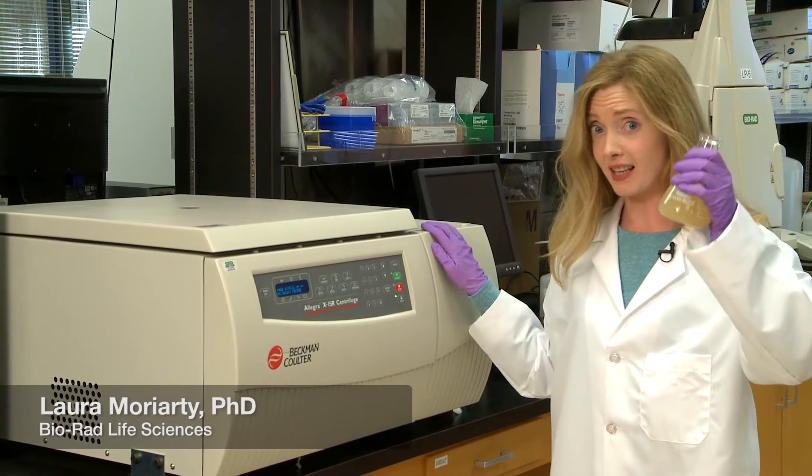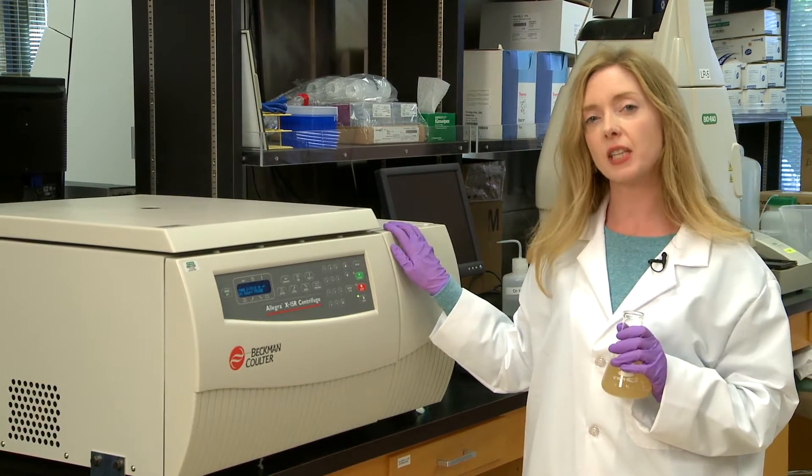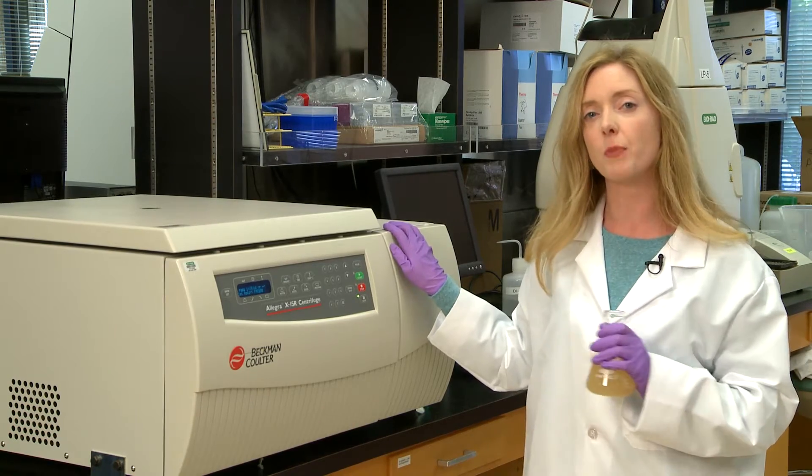Recognize this? Cell lysate. It's the first step in your protein purification journey. Here are some tips to get your sample ready for column chromatography.